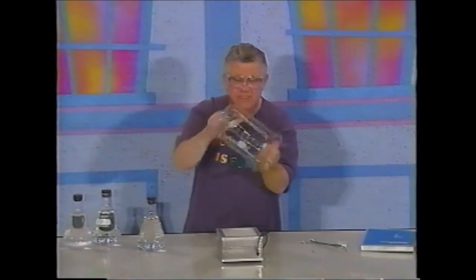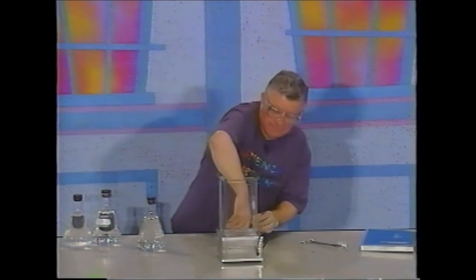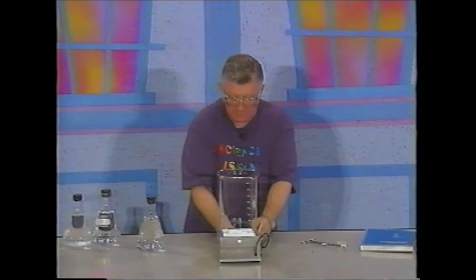So I have this beaker. It's empty except for air. I'm going to take a magnet that's coated with Teflon and put it right there, and then I'm going to push the button to have the light from below. Come on, push the button. Yeah, there it is. And I'm going to turn the motor so that the magnet spins. And it spins and makes some noise, but not too much noise. Can you see the magnet spin?